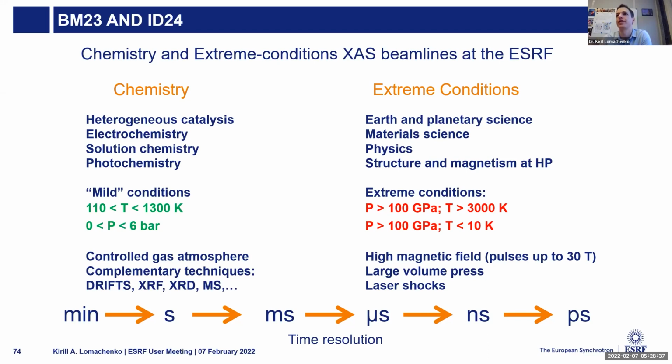So here it's different applications, different instrumentation. You have laser shocks, diamond anvil cells, and large volume presses to study matter at these conditions.